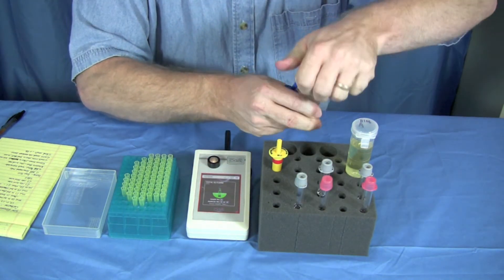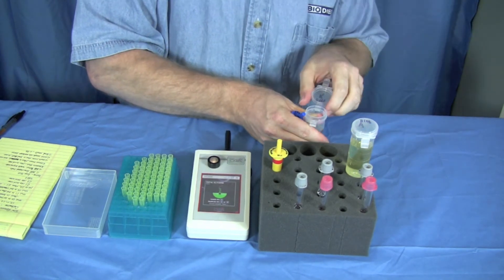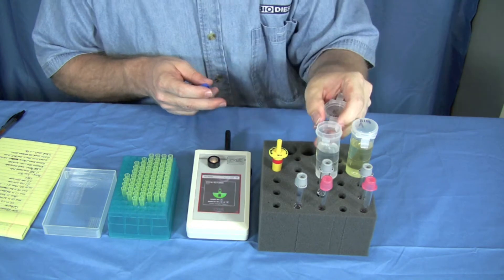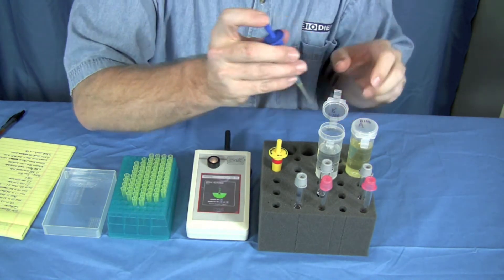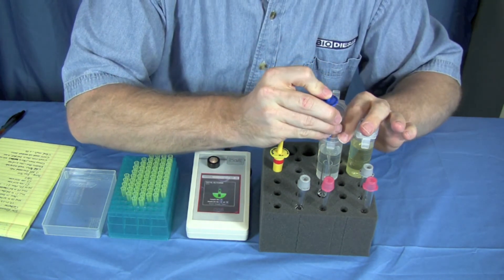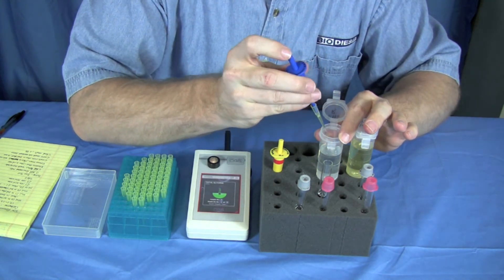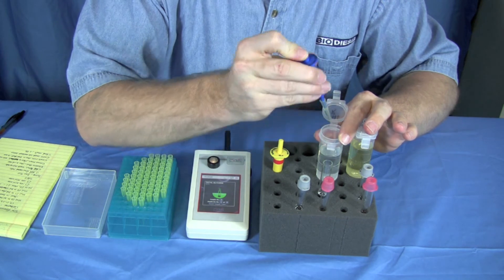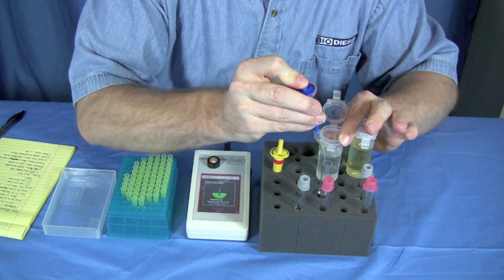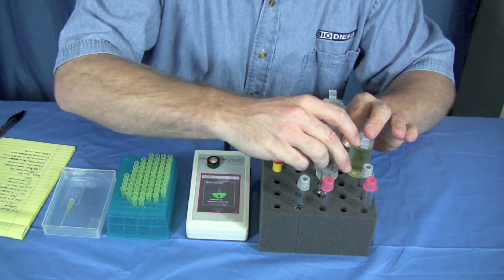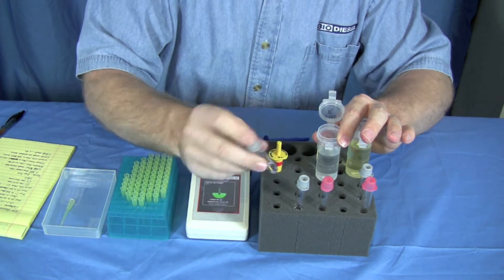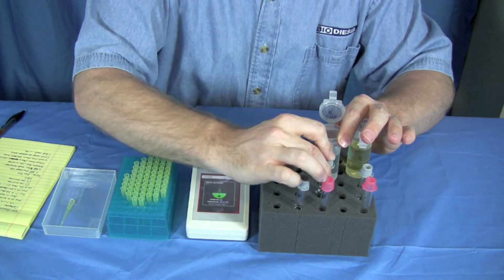We've got biodiesel that was made from coconut oil, believe it or not, which is why it's so clear. 100 microliters to start off with. Remove our cap. One, two. Cap it and you invert this three times. One, two, three. Good and mixed.